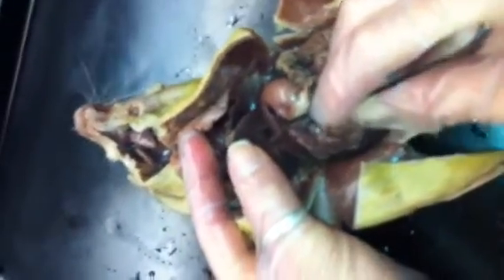Where you can see the pinch. That pinch right there represents the pyloric sphincter, or the end of the stomach.